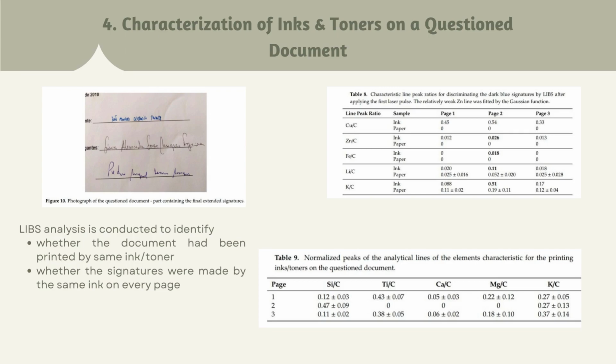Characterization of inks and toners on a questioned document. The goal was to determine whether the document had been printed by the same ink or toner, and whether the signatures were made by the same ink on every page.